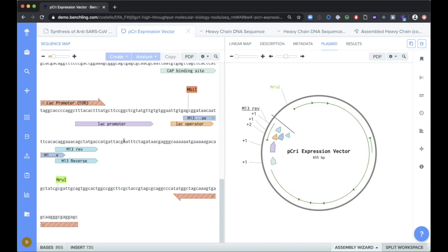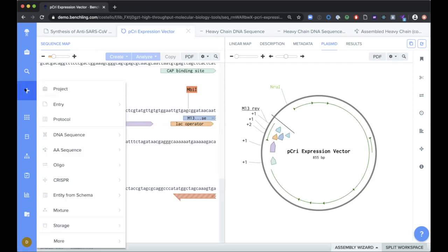And when we say accepted, what we mean is that if you've previously had annotations or characteristics displayed on those maps, we'll bring those annotations over along with it. Happy to provide a full list of the file formats that we currently support after this meeting today, if that's of interest. Okay, so it's time to assemble these.